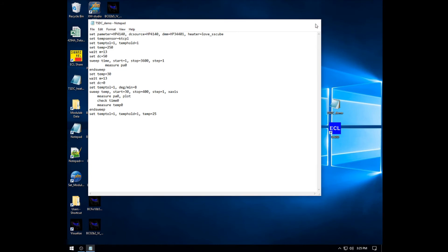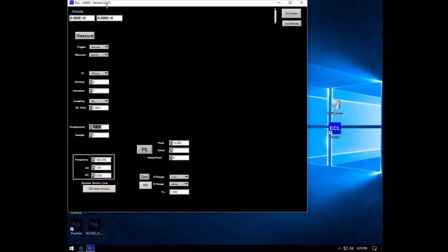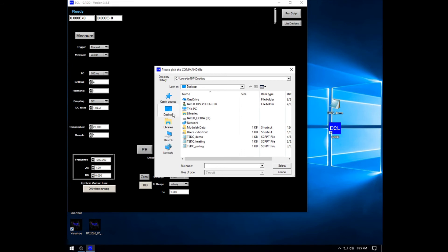Now, let's open a script file using the program called GADD, which is the interface between the experimental setup and the computer.